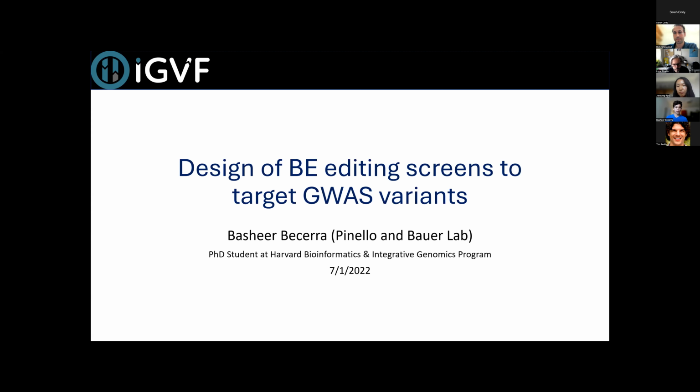And in this tutorial, I just present some of the insights that we have learned from the design of these screens. Of course, this is ongoing work, and keep in mind that the principles I'll introduce in this tutorial may change and improve over time. So just one thing to keep in mind as well.